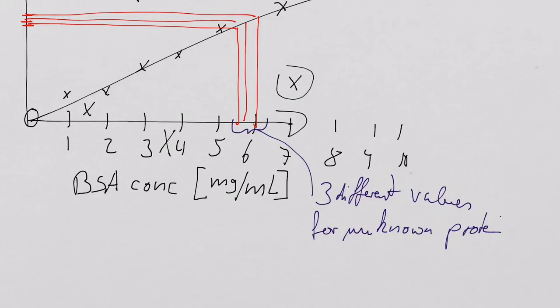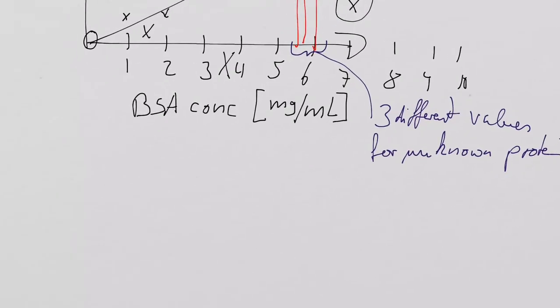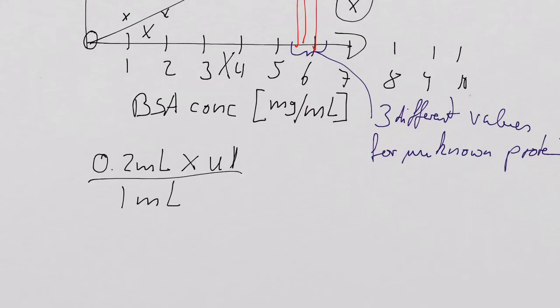Let's remind ourselves what we did. We used 0.2 milliliter of an unknown sample and had that in 1 milliliter.